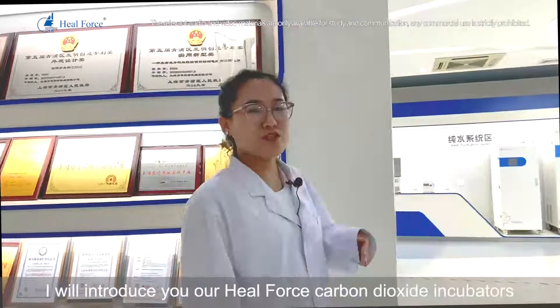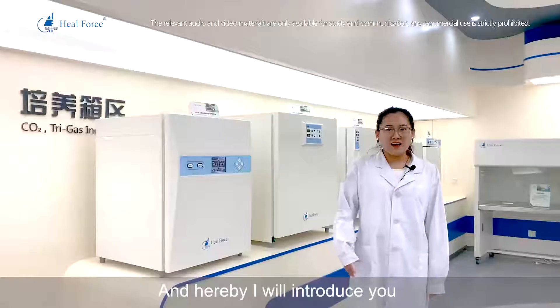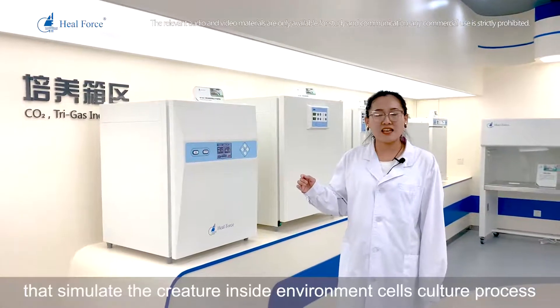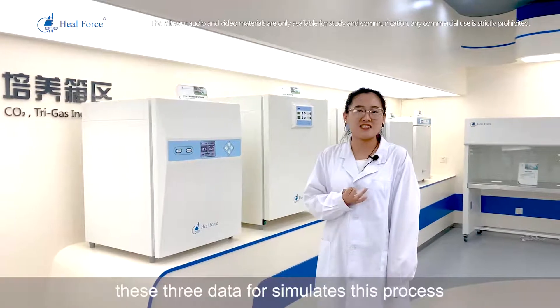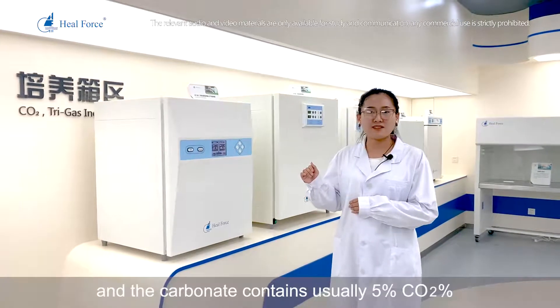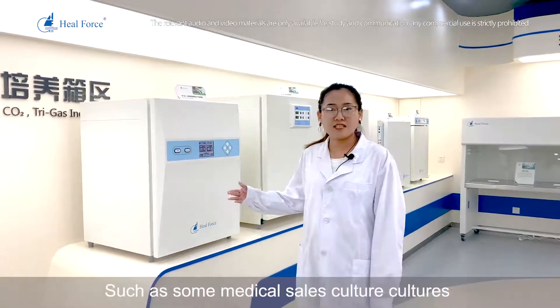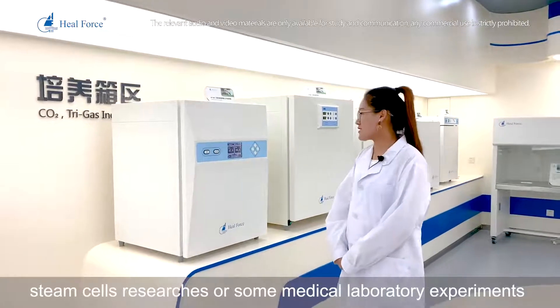Next, I will introduce our HealForce carbon dioxide incubators. A carbon dioxide incubator simulates the internal environment for cell culture processes. We must maintain three key parameters: temperature, humidity, and carbon dioxide percentage. Temperature is typically 37 degrees Celsius, CO2 content is usually 5%, and saturation humidity is usually 95%. These incubators are used for cell cultures, cancer research, stem cell research, and medical laboratory experiments.